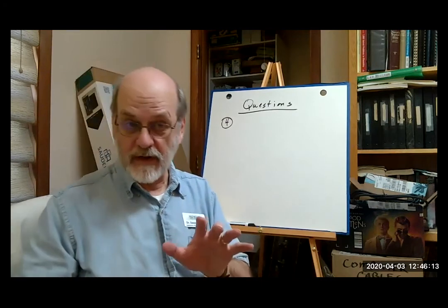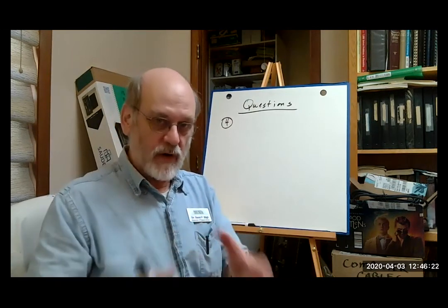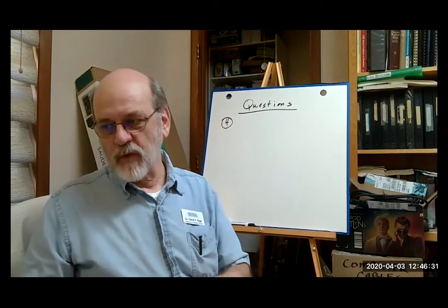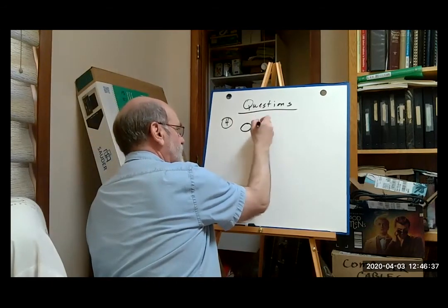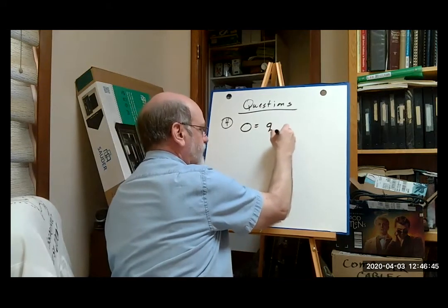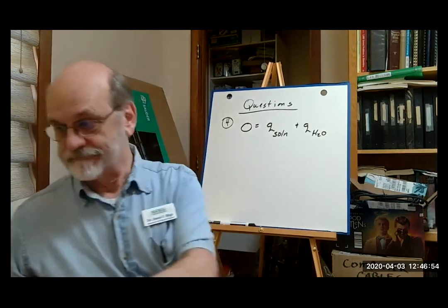All right, so we're ignoring the calorimeter constant, right? The pack and whatever's contained in it would be our calorimeter that we would need to determine a constant for. But in this case, for simplicity's sake, we're ignoring the calorimeter. So really what we're looking for here in number 4 is just, right, 0 equals the heat of solution plus the heat change of the water. Okay?